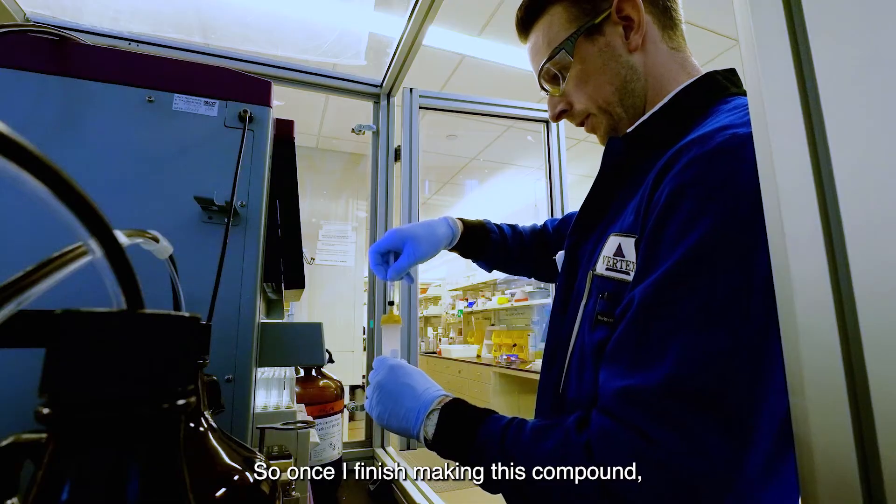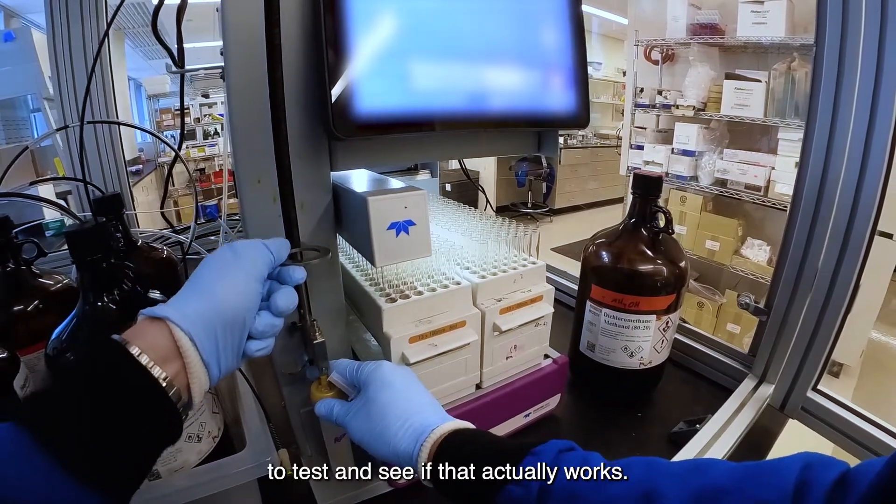So once I finish making this compound, we'll send it over to the biologist to test and see if that actually works.